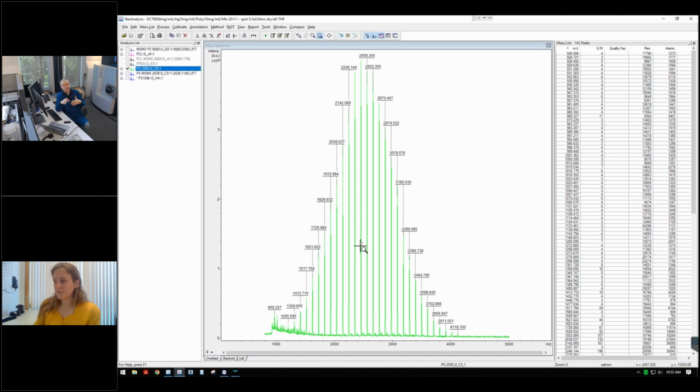And if your sample is gooey or sticky, you could freeze it and then do it on a frozen sample where you get more crystalline nature, and then allow that to come to room temperature, put it into the instrument and acquire a mass spectrum there. So you can cryo blend your samples if necessary.